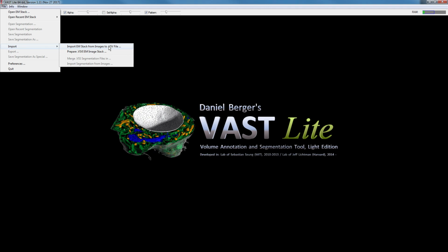So what you would do is to cut up your dataset into tiles, for example 1K by 1K image tiles that make up the whole dataset, and then you would also prepare MIP maps yourself and then store everything in a single folder structure, and prepare a VSVI file, which I can explain in a different video, which allows Vast to access your images directly from the drive and load them up. But in this case our dataset isn't that large, so I will import it into a single VSV file.